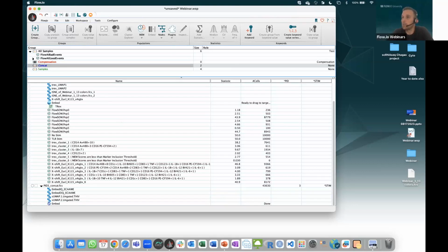At what point does this become data we can import into a statistical package? I don't know exactly what you mean by a statistical package, but yes, everything is math. So you can export that and run it through R if you want. FlowJo just makes it visually more appealing and easier if you don't have any coding skills.